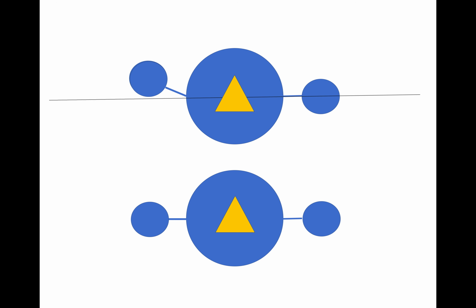Now, another instance in which you might want to use a mask is given here, where we have a protein that has two flexible ends. Let's imagine that it's like a homodimer or something like that, and it's split down the middle, and it has a floppy domain over here and a floppy domain over here, and the alignment of the center is represented by this arrow.